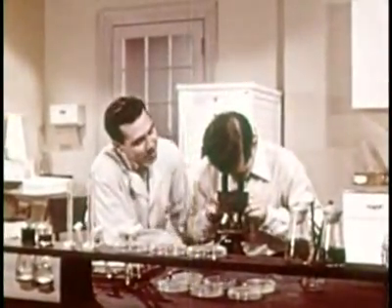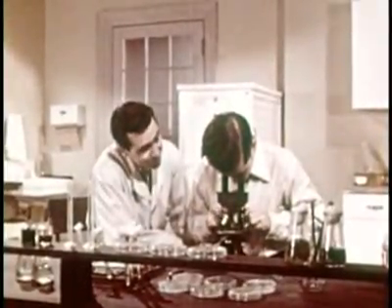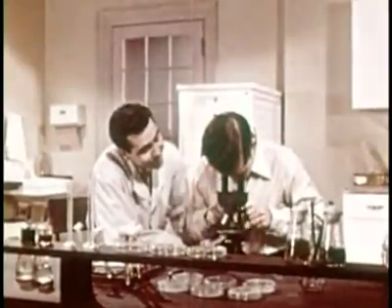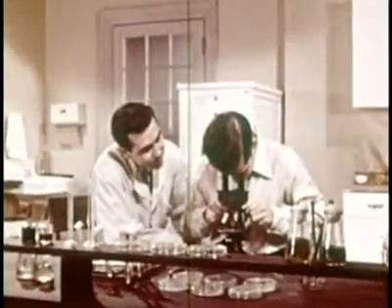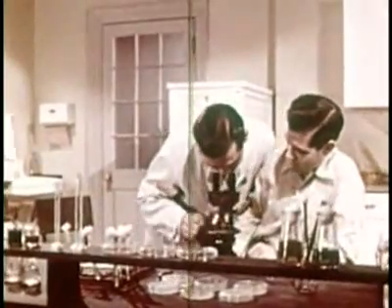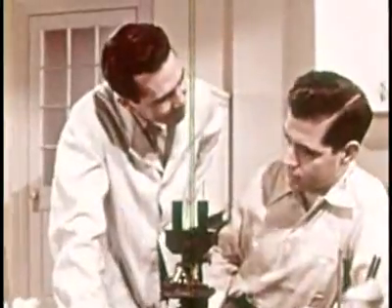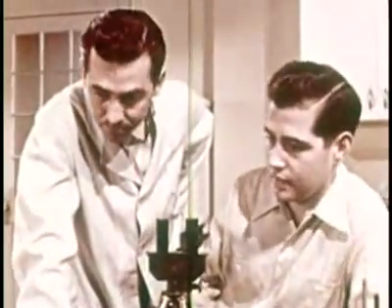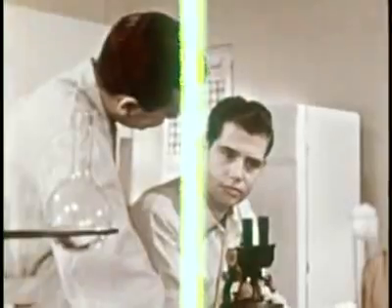Try using the fine adjustment knob. And do it more slowly. You're likely to miss the cells you're looking for, even though they may be there. Okay, I'm trying. Say, here they are. Here, look. Good. You know what kind they are? No. All I know is that they came out of that test tube that you gave me. Then they're one of the kinds of bacteria that cause food to spoil.